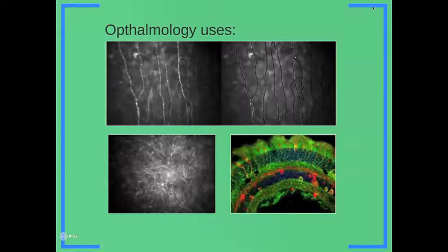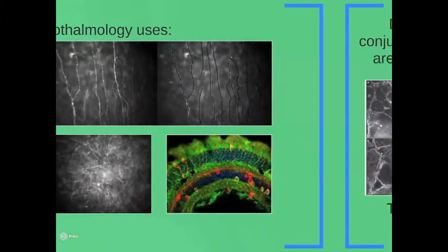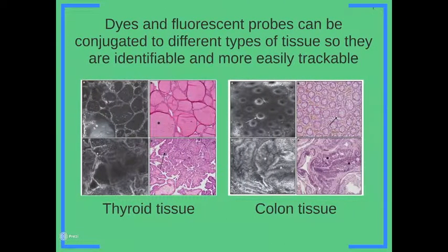In the bottom right image, fluorescent signals can be seen on different structural parts of the retina. Confocal microscopes have even been used to determine the thickness of the cornea based on the depth of the focal plane of the microscope. Confocal microscopes are widely used to characterize biological tissues.